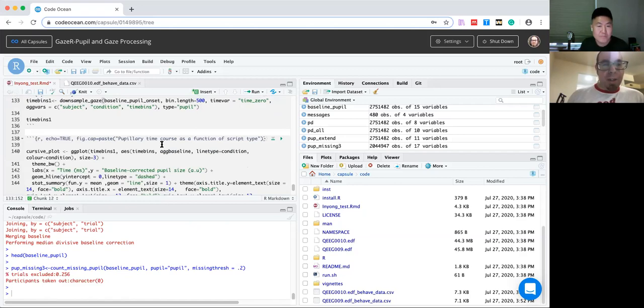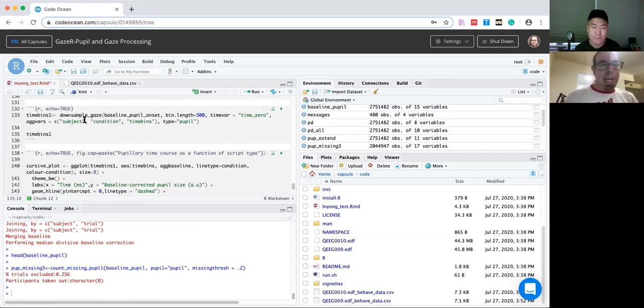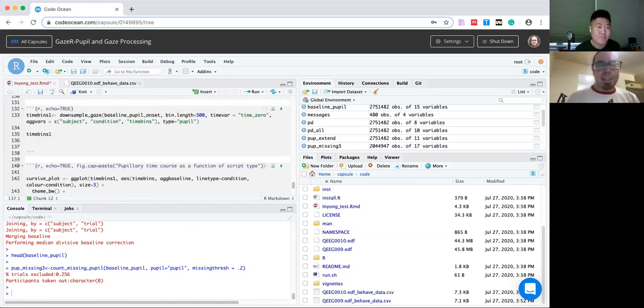After that, I don't know what you're comfortable doing, but at this stage you can save this as a CSV file, read it into MATLAB, and do your data analysis and your plotting from MATLAB once you get here. Because right here is when you have your clean data. The data is cleaned here. Right. And also for any across subject statistics, we need this time course, right? So I think it makes a lot of sense to save the data here.